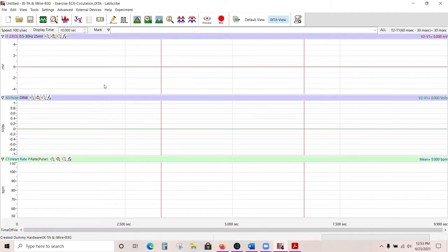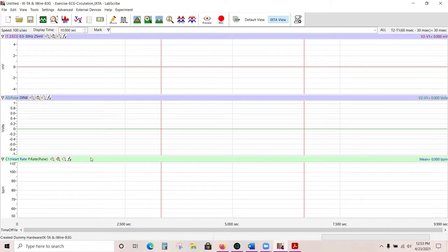Our graphs are color coded. Anything with a blue graph background bar means that the data being recorded on those channels are live, coming directly from your subject. A light green background bar means that the data being recorded on that channel will be calculated from your subject's other channels. In this case, we are calculating heart rate from the pulse graph.